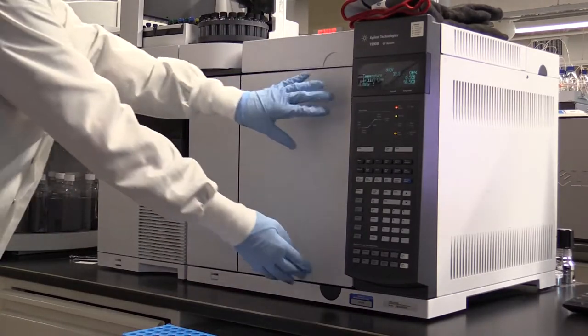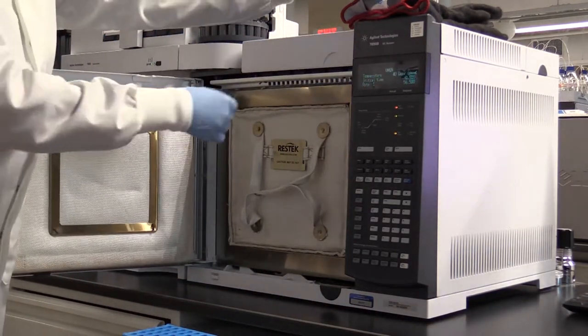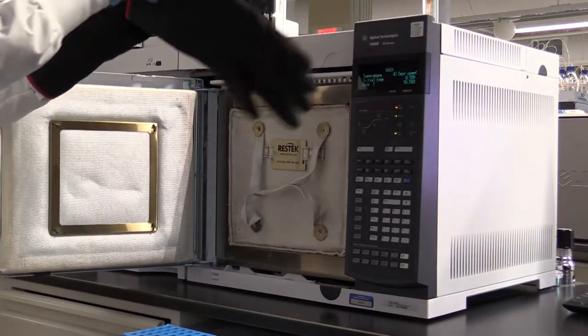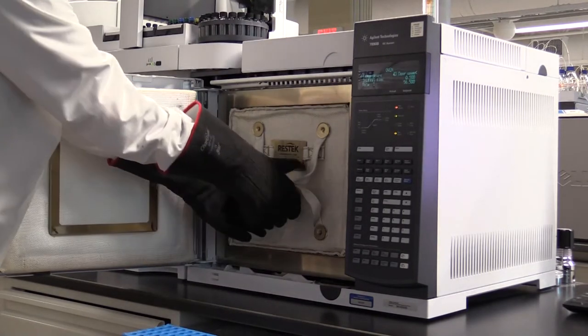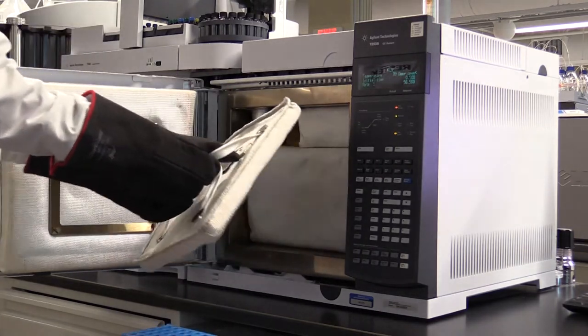The metal fasteners and label tag on the plate insert may still be hot even after the GC oven is cooled down. To avoid burns, use the strap to remove the plate insert or wear heat-resistant gloves. To remove the plate insert, grip the strap and remove it by pulling the bottom edge out first.